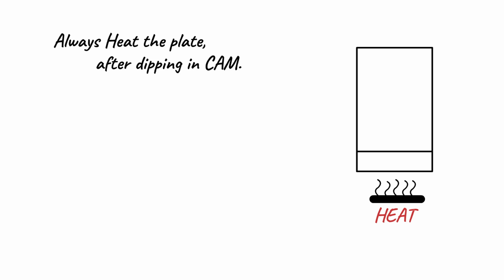Always heat the plate after dipping in CAM. By heating, the colors develop over 10 to 20 seconds and continue to intensify. Be careful because overheating turns everything brown and you lose the color differentiation that makes CAM useful.